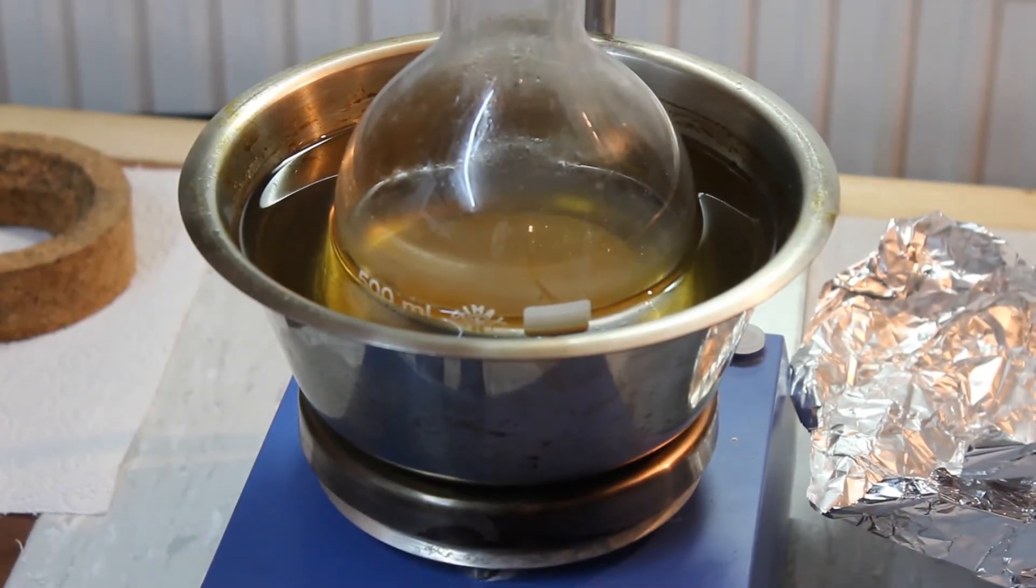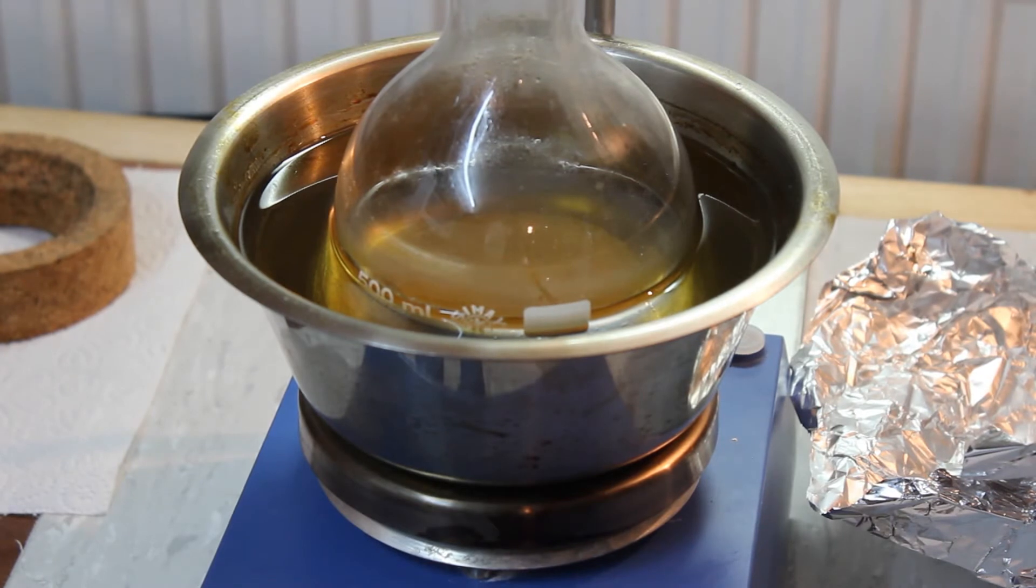We are just now getting the first bubbles of ether but the rate of production is still too slow. So we have to continue heating. The target temperature is 140 to 145 degrees Celsius. Be sure to not heat it over 150 degrees Celsius since then the elimination reaction will be favored and we'll start producing ethylene gas.